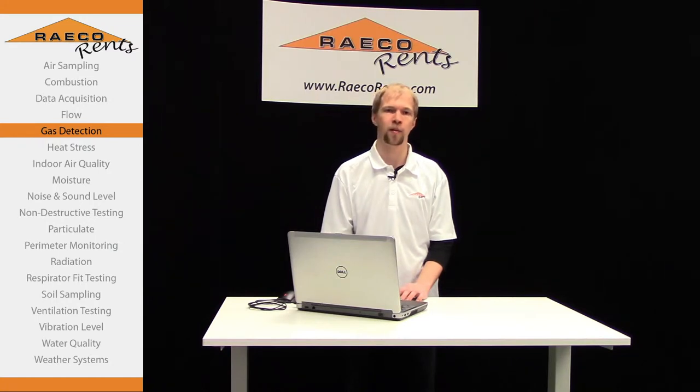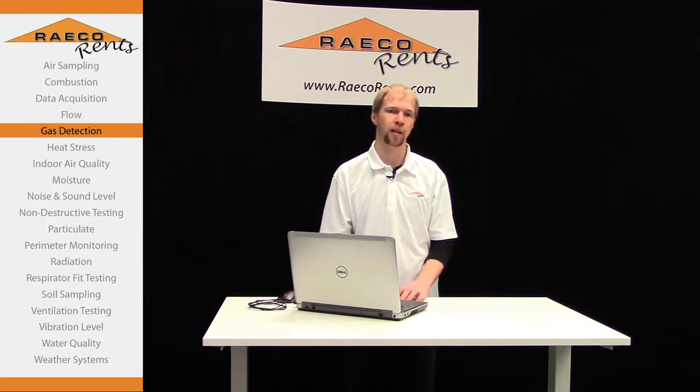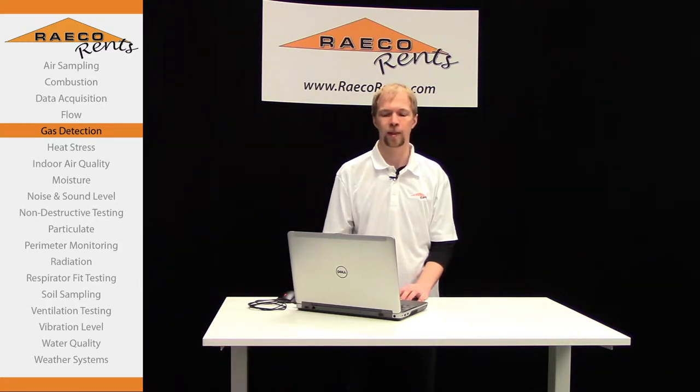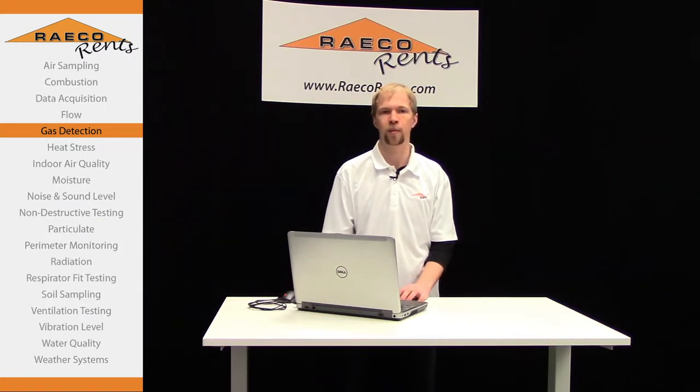This demonstration will cover how to load gases from the basic library as well as load gases from the extended library. The rest of this video will take place on the CalcMet software, so let's open that up and get right into it.